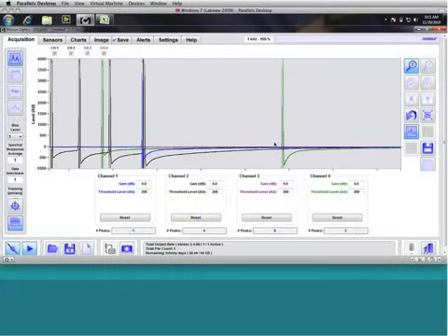So first, we've just connected our optical sensors to our instrument, or they were already connected to our instrument, and we launched the application. So a few things here are immediately apparent. We have some very abnormal-looking sensor shapes. If we look down at the level, we see a level of 0 here, and that's where we would expect our noise floor to be. So we're seeing quite a bit of signal below that 0 level.